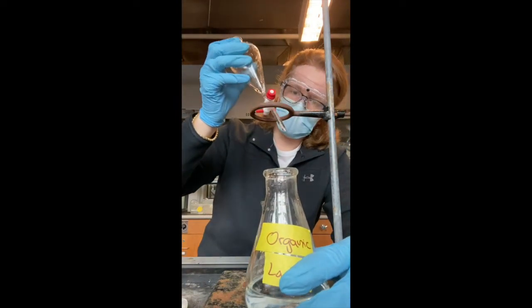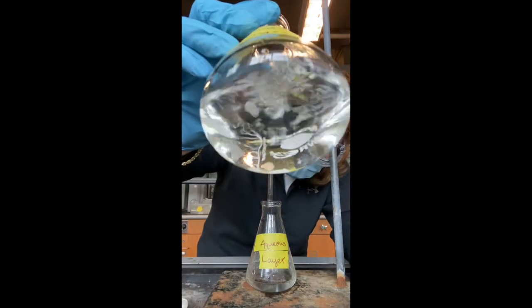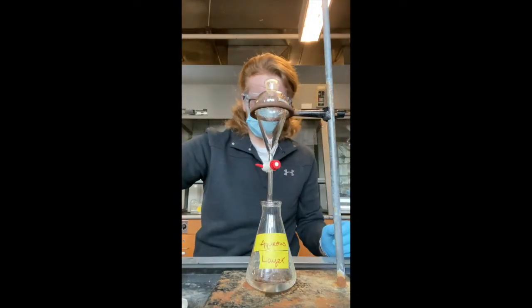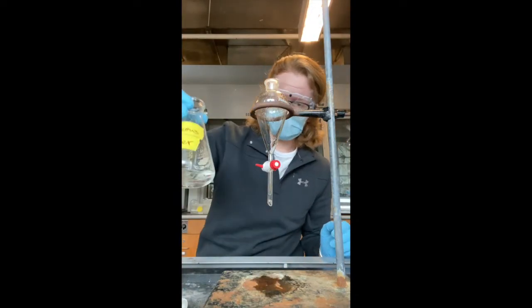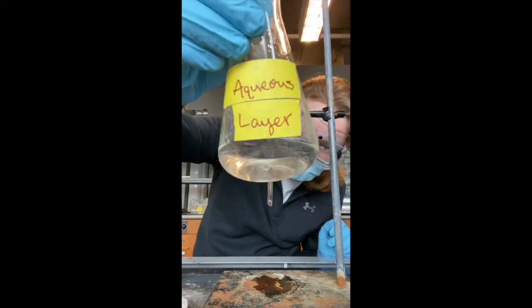As you can now see here, with the flask holding the organic layer, the solvent hexane was able to extract out the compound, benzophenone, and now the aqueous layer is left with just distilled water in it. It has no more benzophenone.